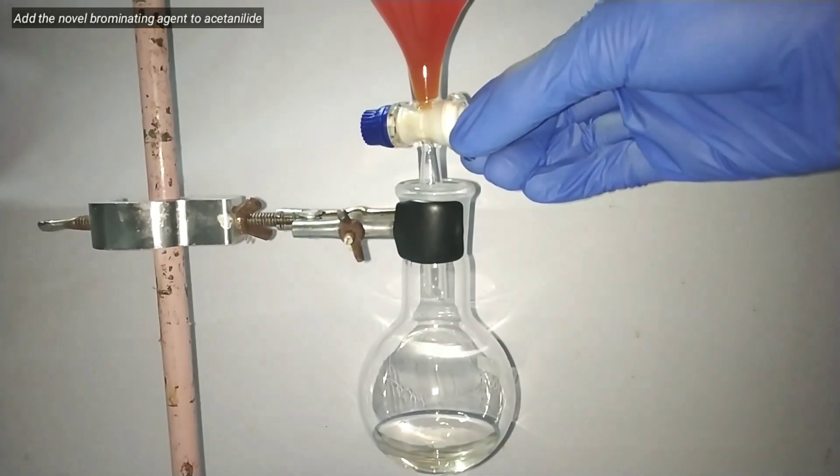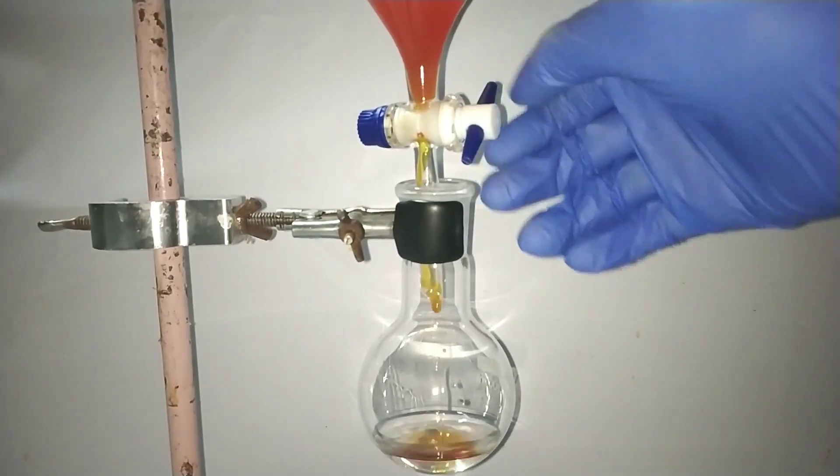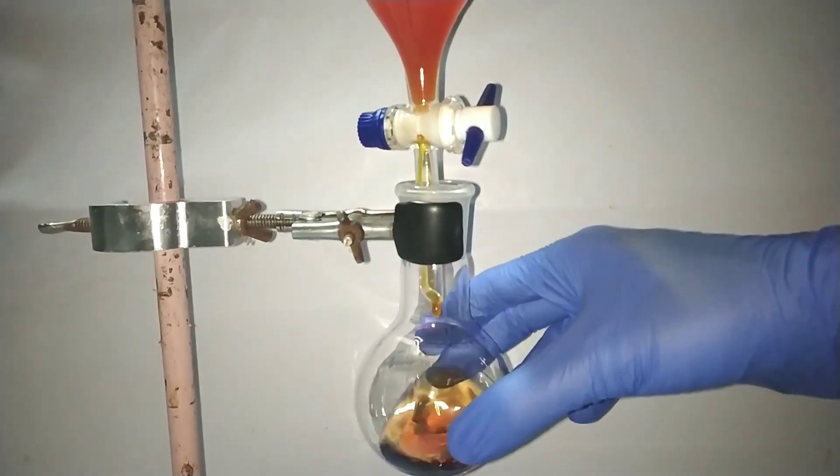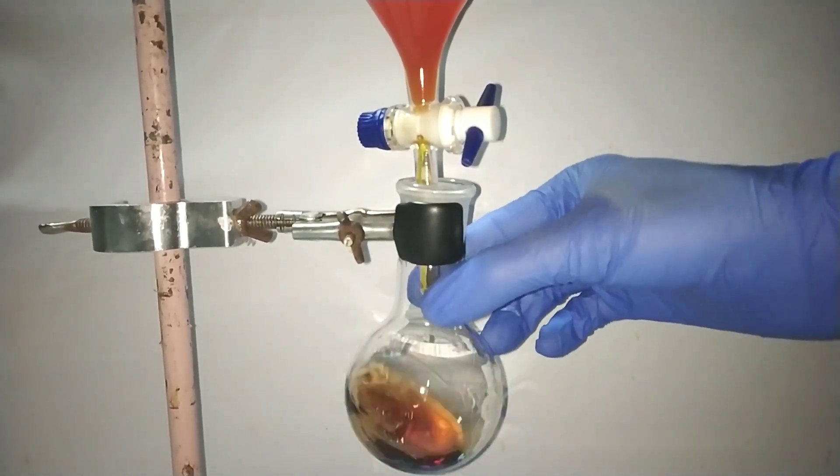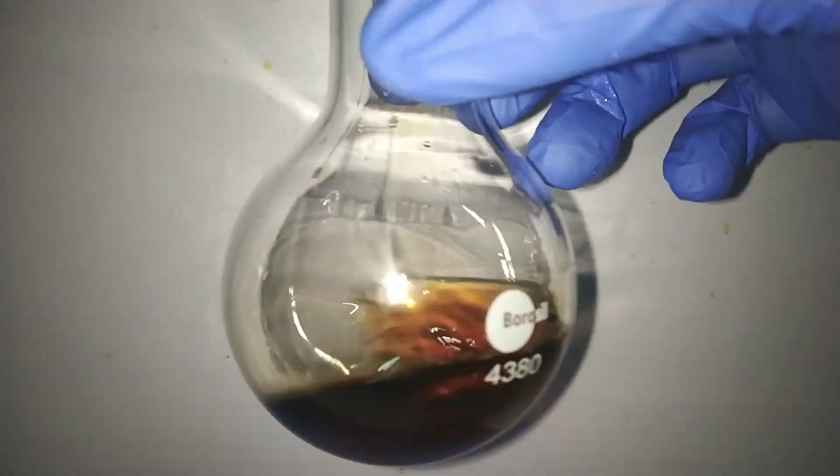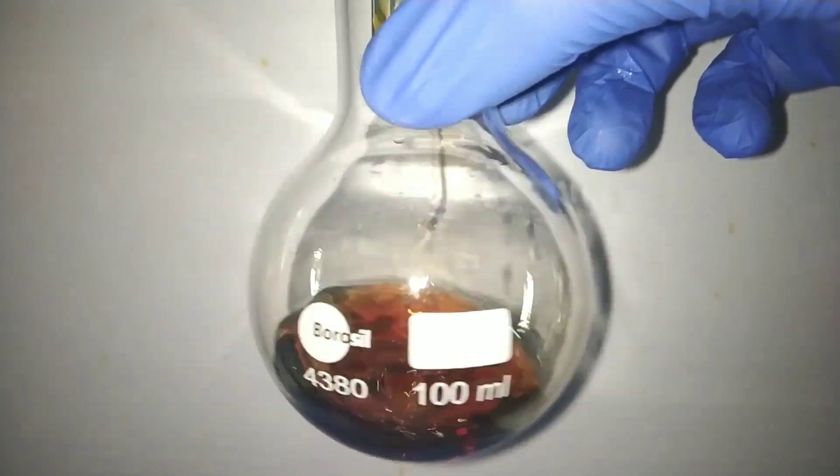Now we add the brominating agent in the separatory funnel and we slowly open the knob so that the ceric ammonium nitrate and sodium bromide mixture falls very slowly dropwise to the acetanilide solution. Along with the addition swirl the flask to mix the contents well.